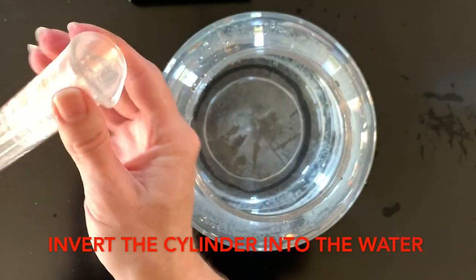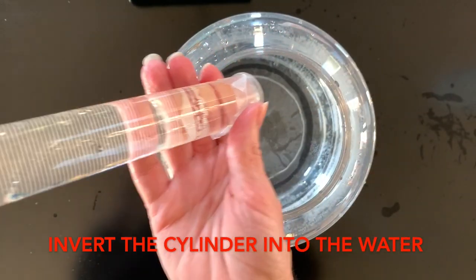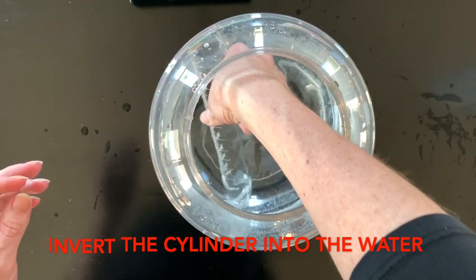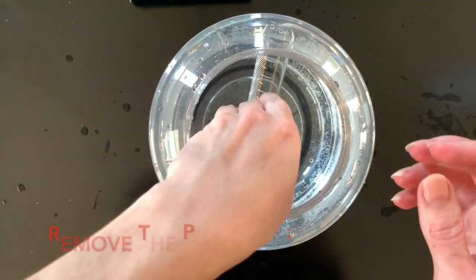You're going to invert this graduated cylinder, making sure that there are no air bubbles before you start collecting the gas over water. You're going to place it into the water basin and get ready to remove the parafilm before you can start collecting the gas.